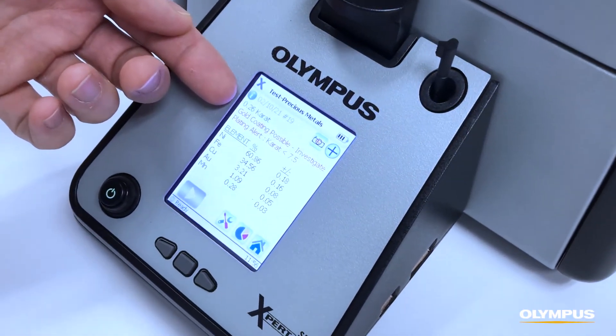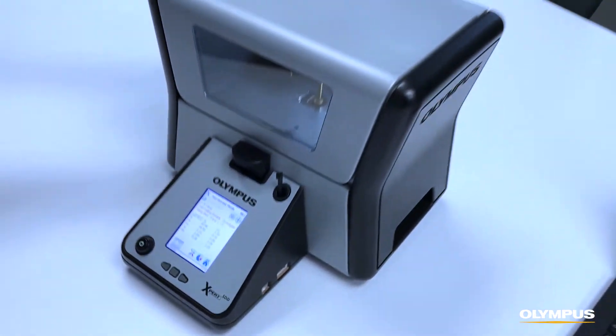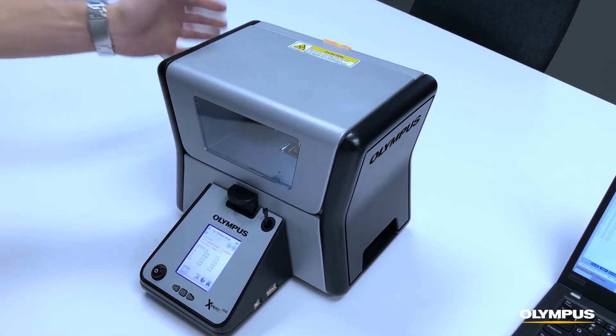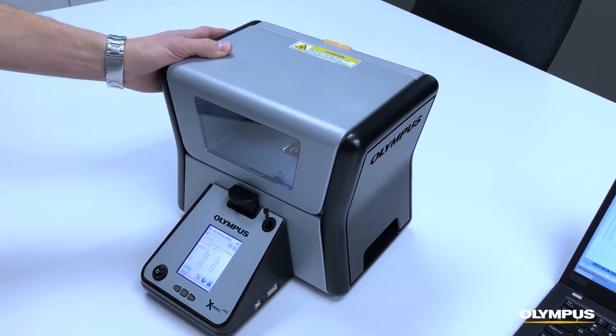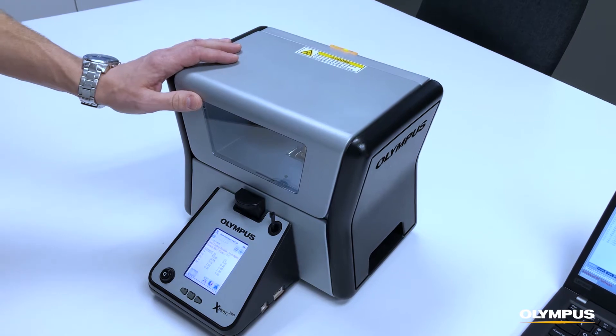The Gold Expert is an all-in-one form factor with a small footprint. You can plug it into the wall for power or run it off a battery, so you can easily transport the Gold Expert to trade shows and other mobile events where you want to take the instrument out to your customers.